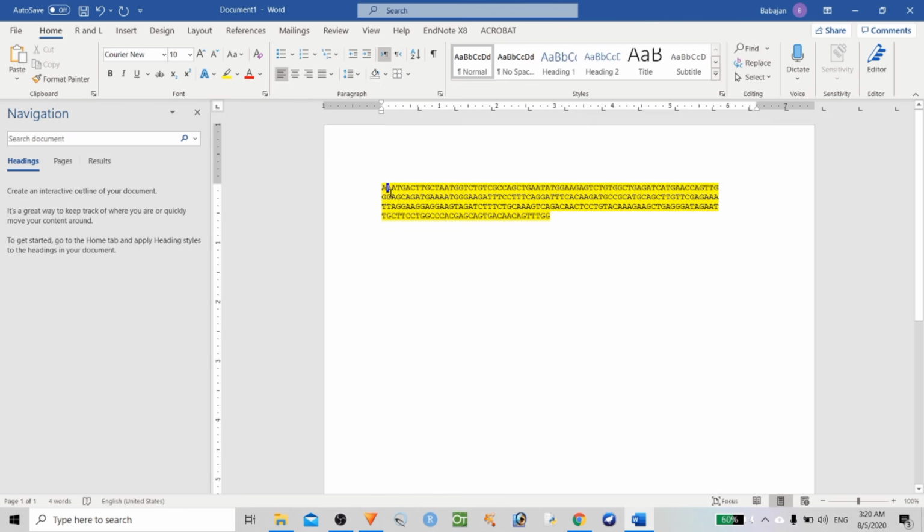At the start, you always have to remember with Sanger sequencing, at the start of the primer you will always find stutterings, mismatch stutterings. Once it crosses 50 to 60 base pairs, only then will you find very smooth reading or smooth DNA synthesis. If I design a primer in an exon region, I always have a chance to miss some of the key residues at the 5' and 3' ends. To avoid this circumstance, I can go to the intronic regions.